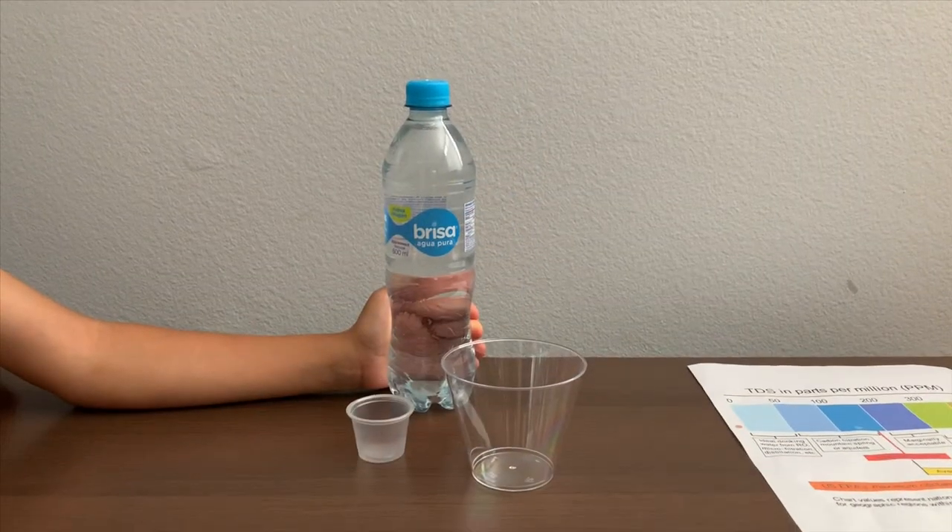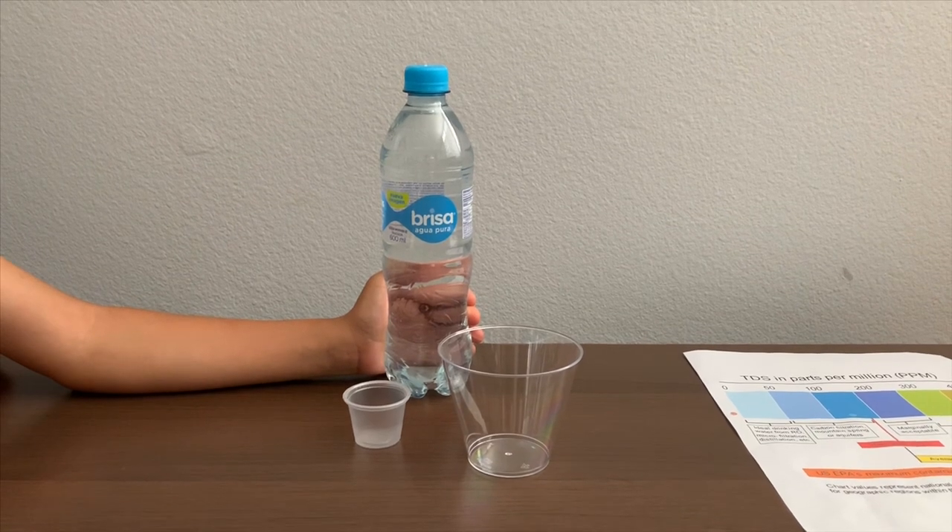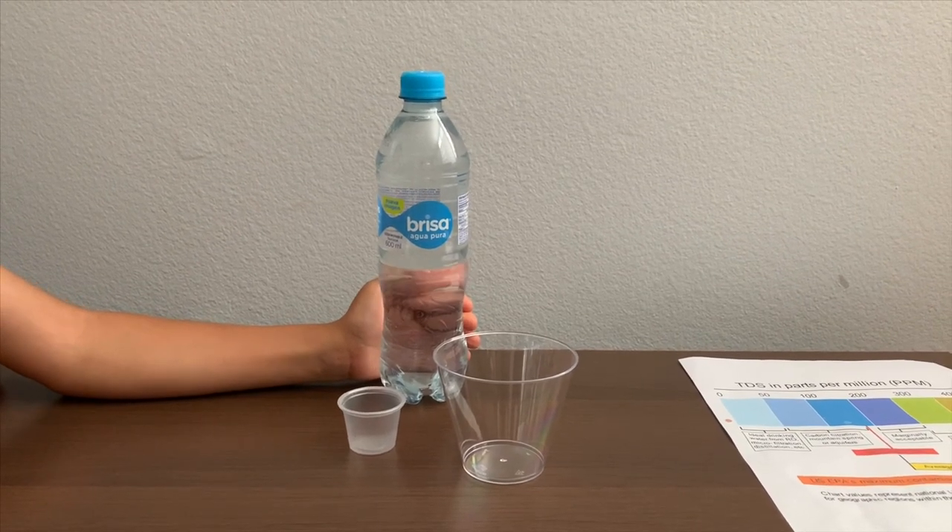This is Brisa Agua Pura Purified Drinking Water. We bought it from Colombia. Let's test the pH and TDS levels.